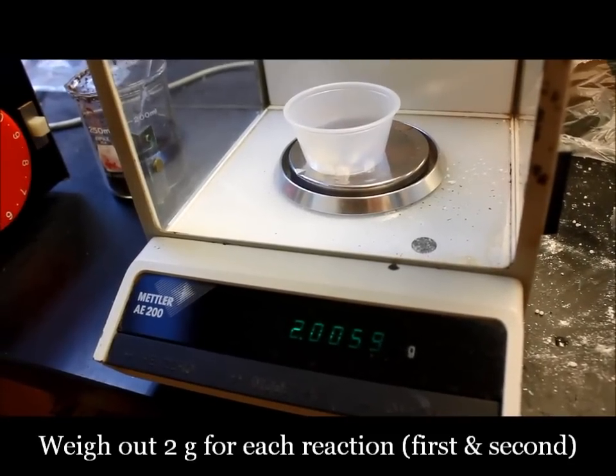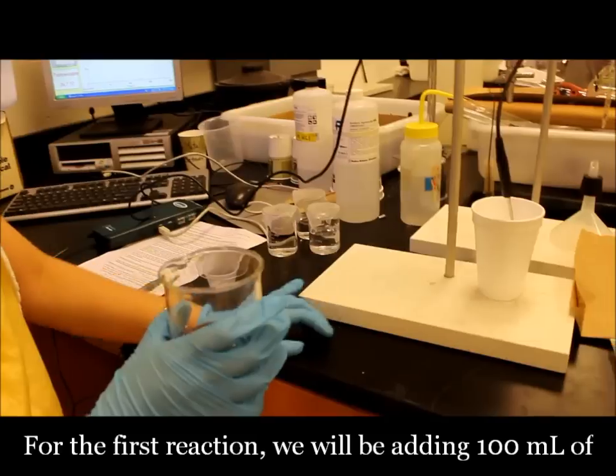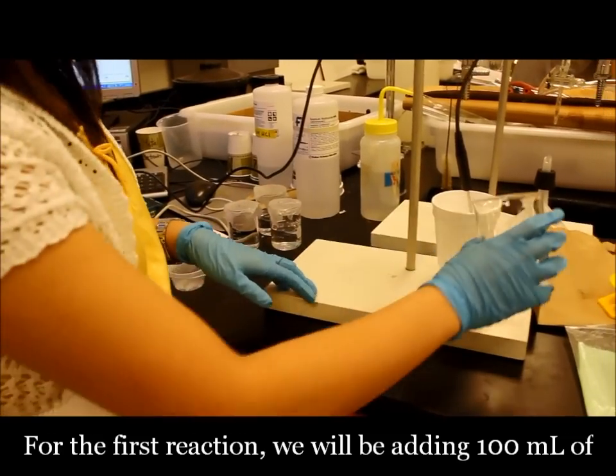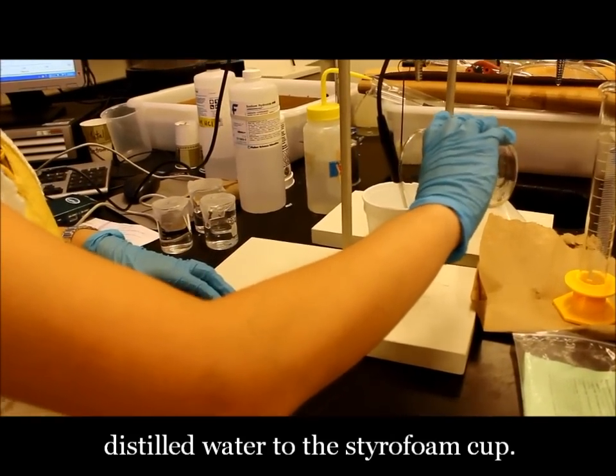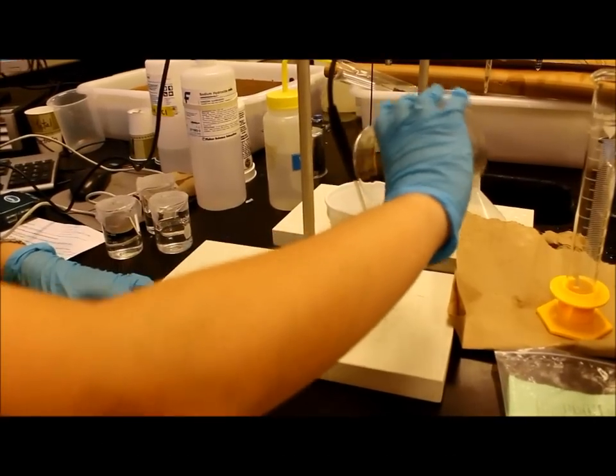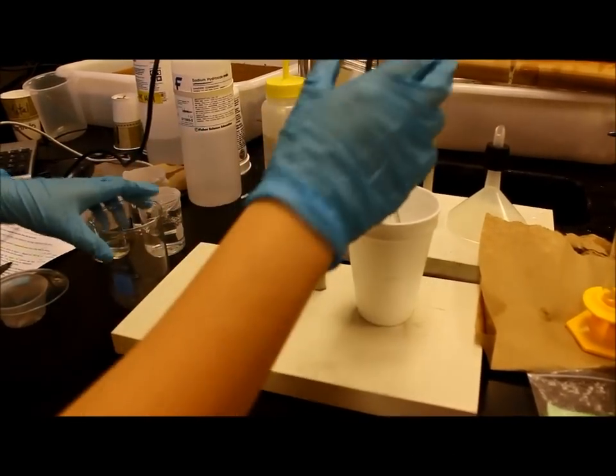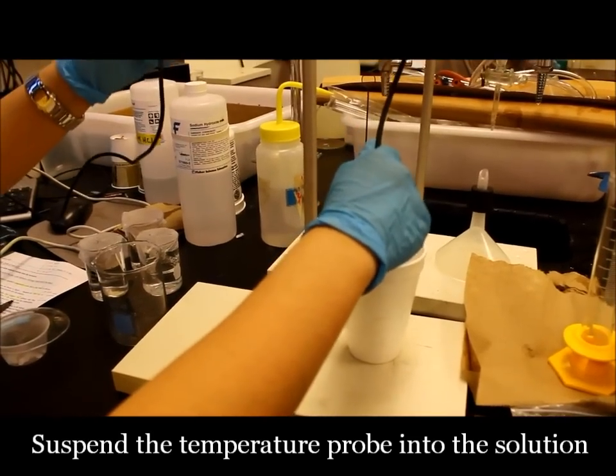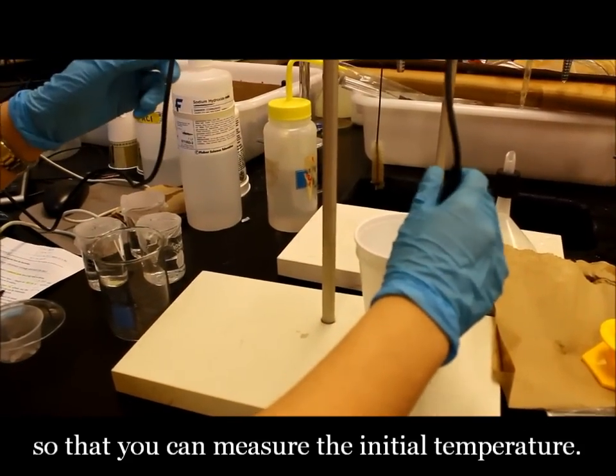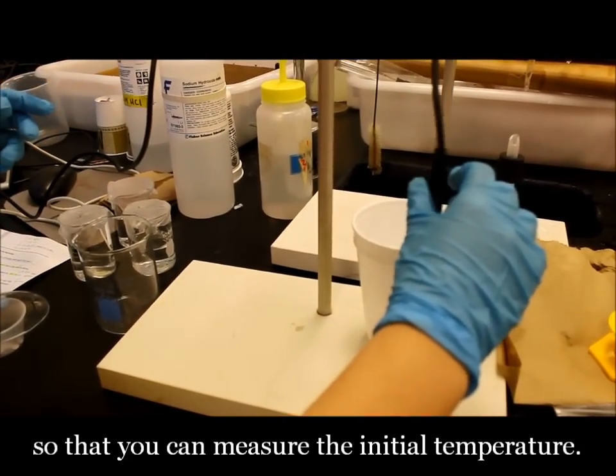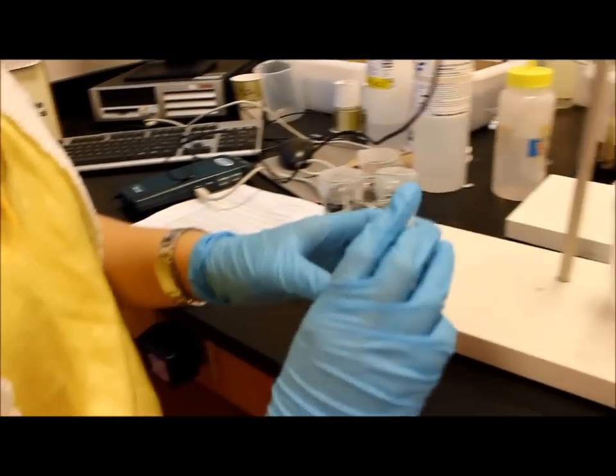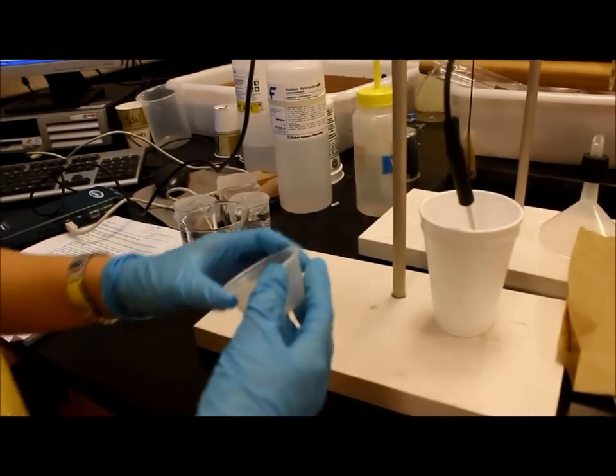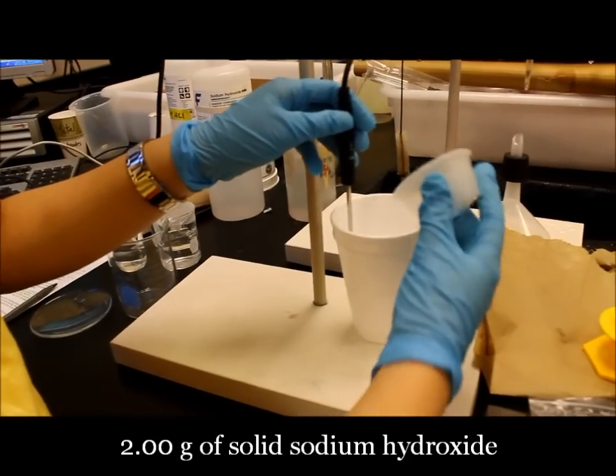Here we have 2 grams of solid sodium hydroxide. So for the first reaction, we're going to add 100 milliliters of distilled water to the styrofoam cup and suspend the temperature probe into the solution so that you can measure the initial temperature. And then we're going to add the 2 grams of solid sodium hydroxide.